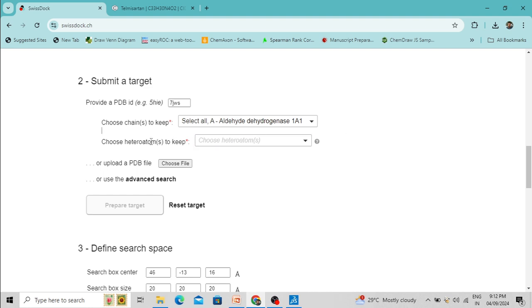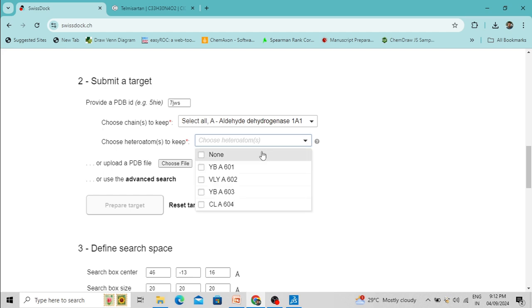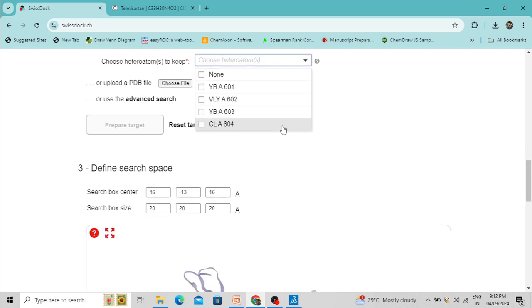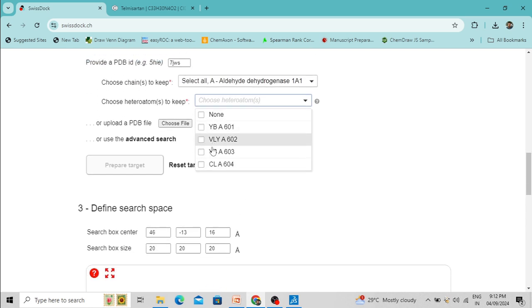Choose which heteroatoms to keep. Heteroatoms are the molecules associated with the protein chain, such as water molecules or other ligands. These are the ligands attached to this protein molecule. You don't need to keep these heteroatoms, so click 'None' — your protein molecule will be cleared of all heteroatoms.